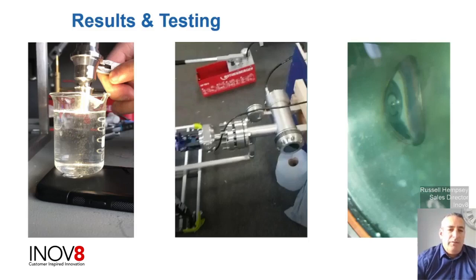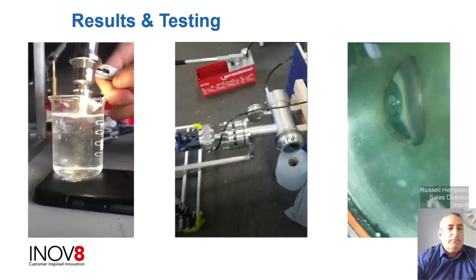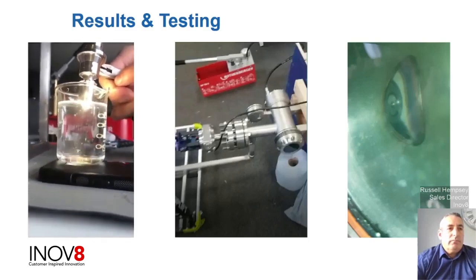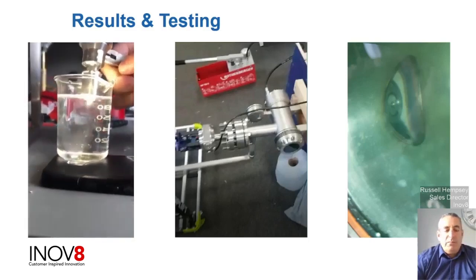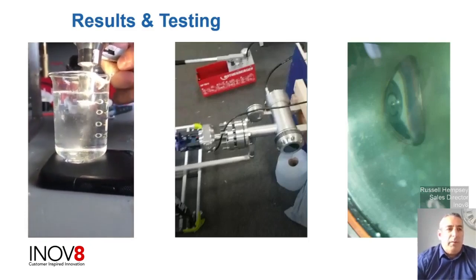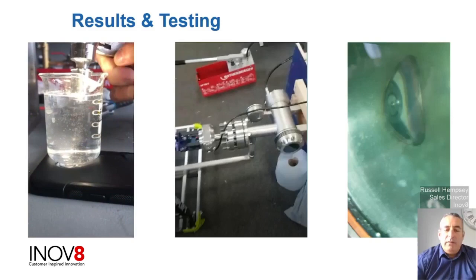And I'm going to press play on a video here. Again, just watch your headsets for the noise. So you can see we're just testing different settings here, making sure that the transducer is responding properly. So we did this until we were happy that the transducer could then go into an actual probe.